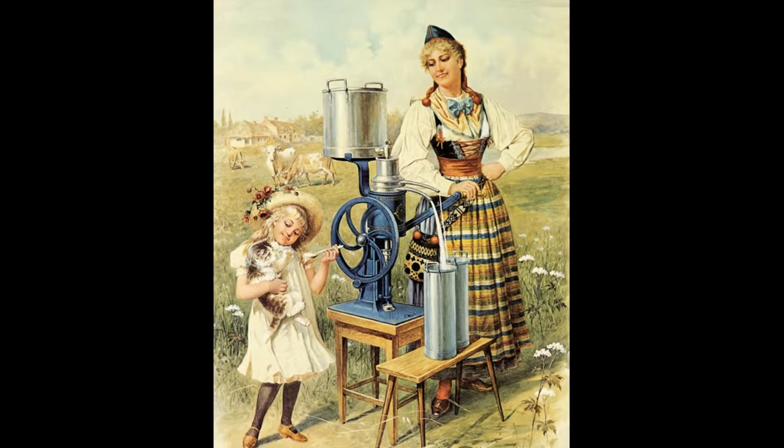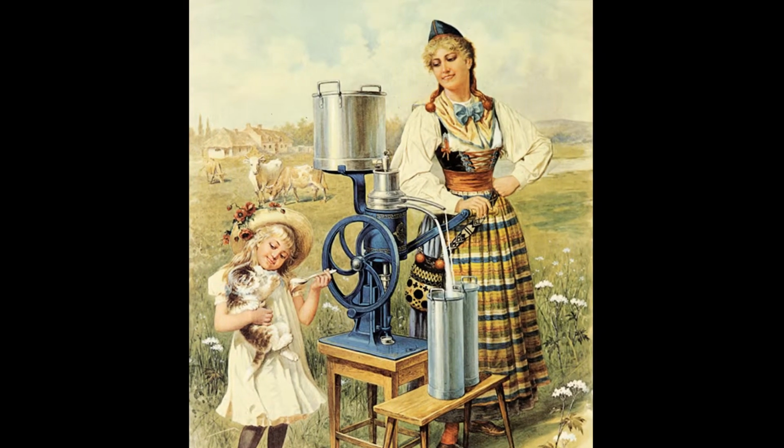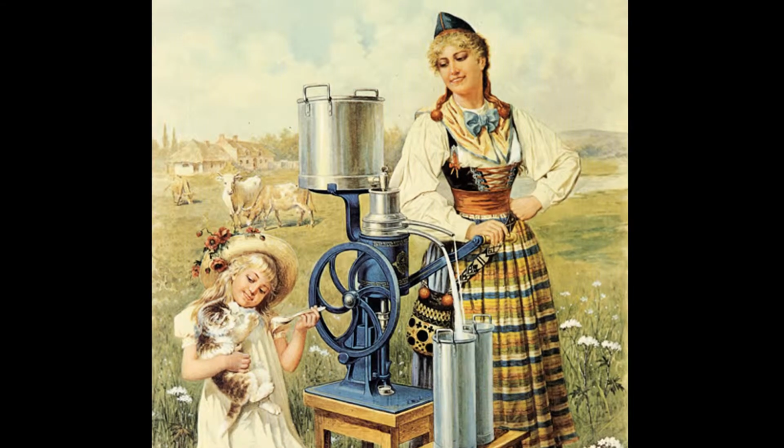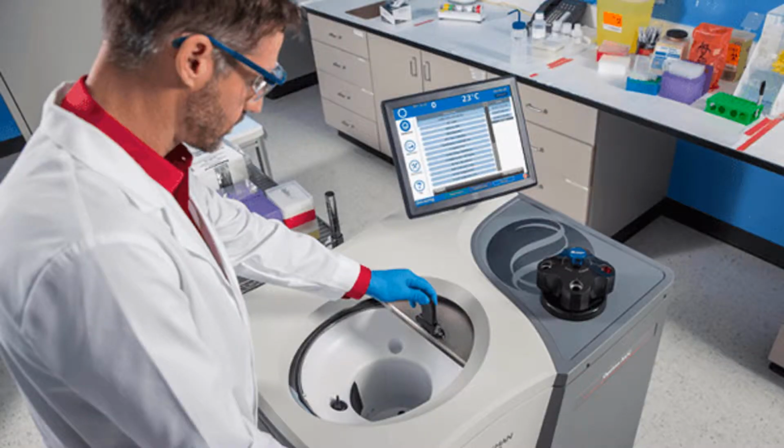Centrifuges have been used for many years to separate mixtures with components of different densities. Here you see cream being separated from milk. They can be relatively small, like the ones that fit on your benchtop in the lab, or something larger, like this one, the size of a washing machine. Solomon is going to help us demonstrate the use of a centrifuge.